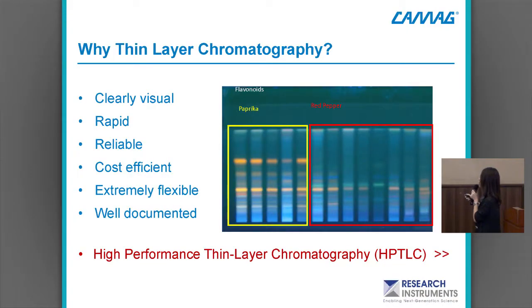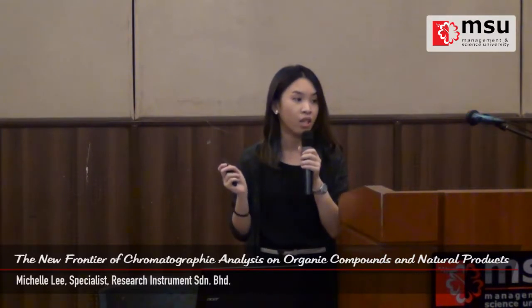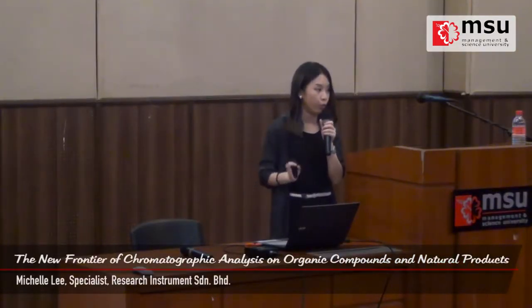Alright, but of course within the same paprika, different kinds of paprikas, you might see very slight, minor differences, but this is something that we can't control, because especially with natural products, depending on where you harvest from, different geographical factors are definitely going to give you some impurities. Alright, but somehow we're still able to look into the fingerprints.